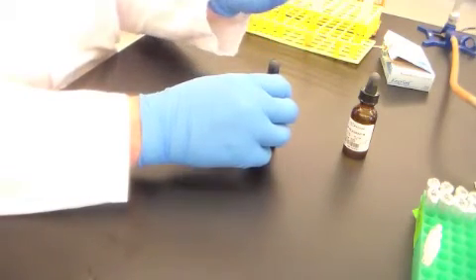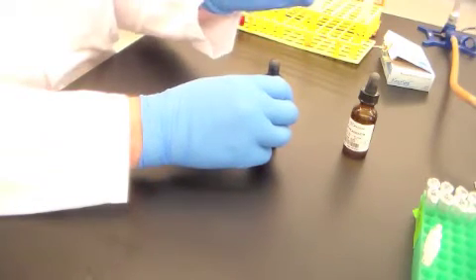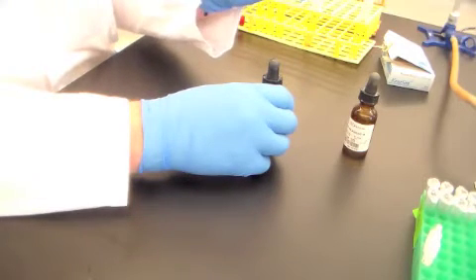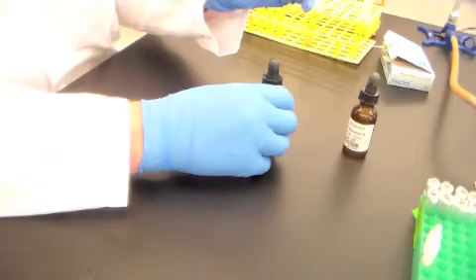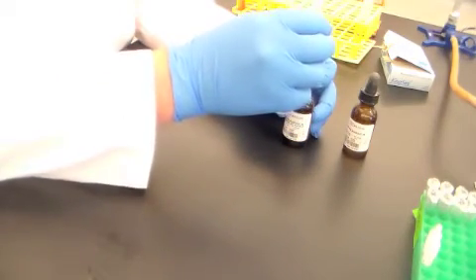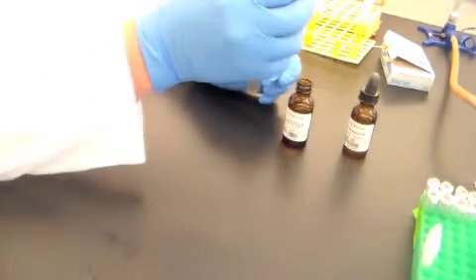So this year, the TAs convinced me to see if we could capture any gas being produced. So they put Durham fermentation vials in here. And unfortunately, I'm not seeing any production of gas. Maybe you will in yours. But let's do the nitrate test on this collection of soil bacteria.